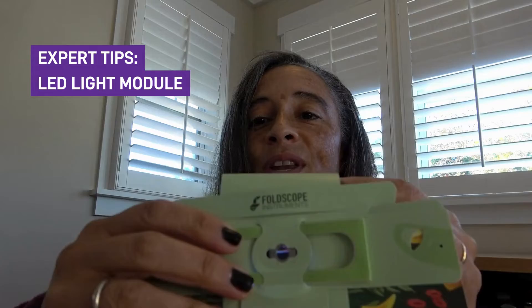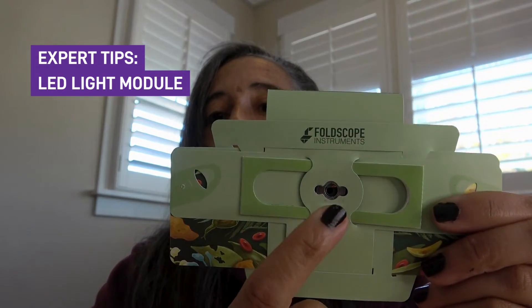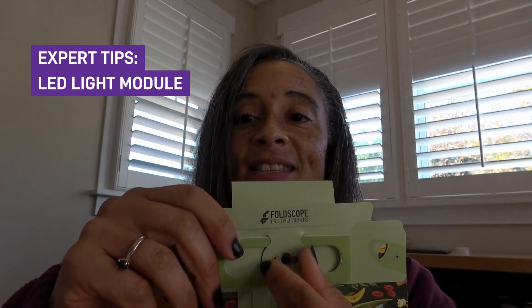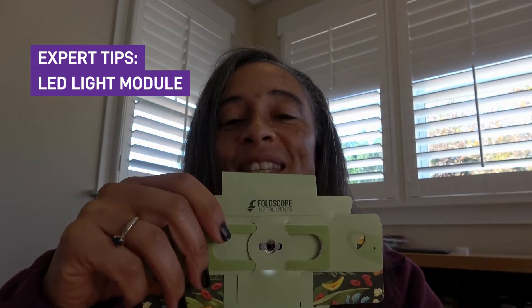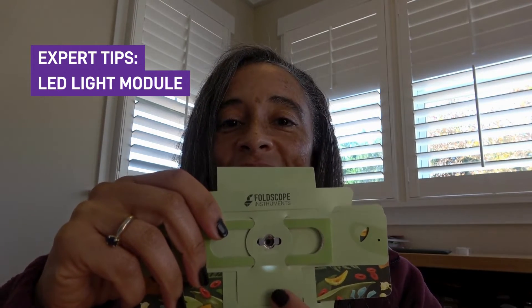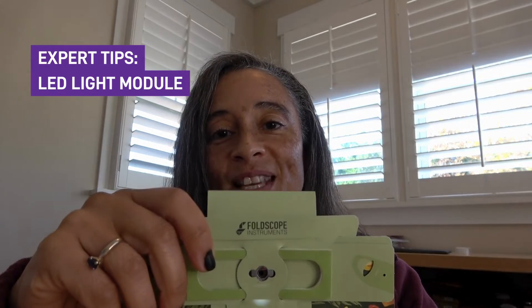The light is not going through the sample — it's going to be going through the hole. When I show you from the front, you can see where the light is shining, but nothing is coming through that sample. Because what's happening is when you put the lens on there, the light will come up and bounce, then hit your sample from the top. This is called reflective lighting — when light bounces, it's reflective. It will hit the sample from the top and allow you to see some of the features of opaque objects that you hadn't been able to see before.